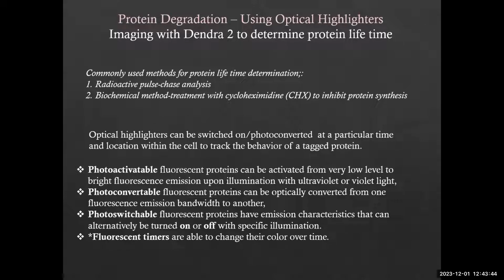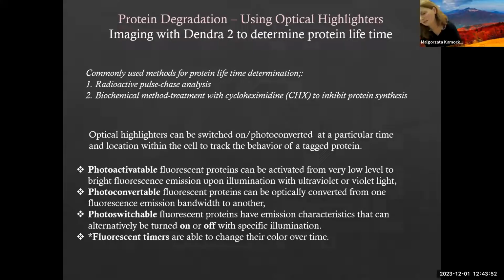Another question: does your core help with the optical clearing techniques, or is it only imaging of cleared tissues? Unfortunately, it's only imaging of cleared tissues. But we can help you choose the right method. We would probably have to do some research ourselves, but we can do that. And in the process, we can help you with imaging as well, because it's very important to choose the correct objective and the correct microscope to make sure that you can properly evaluate cleared tissue.